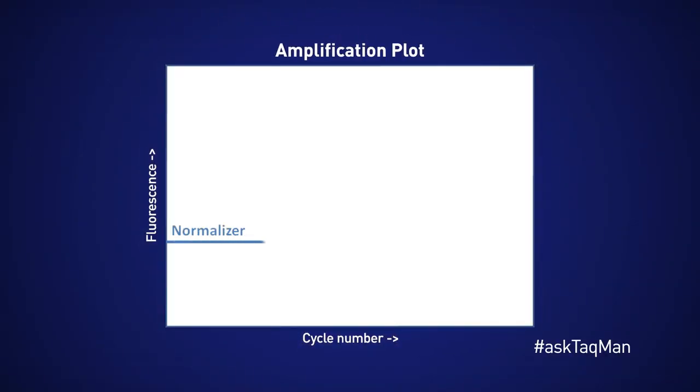Fortunately, there's an adjustment we can make that often solves this problem. Namely, primer limiting the normalizer gene. If we significantly reduce the normalizer assay's primer concentration, it will hit its plateau much earlier. Not because it used up the DNTPs, but rather its own primer.